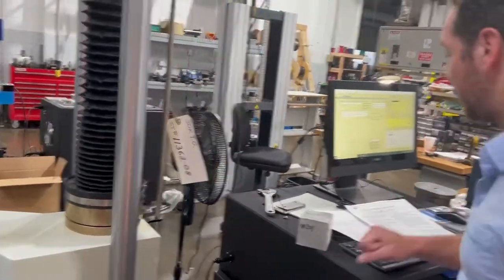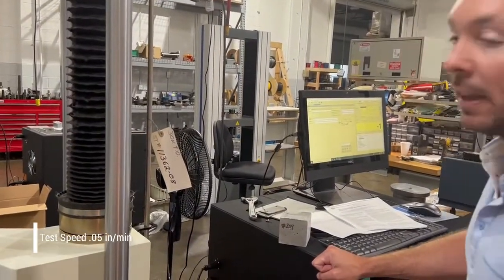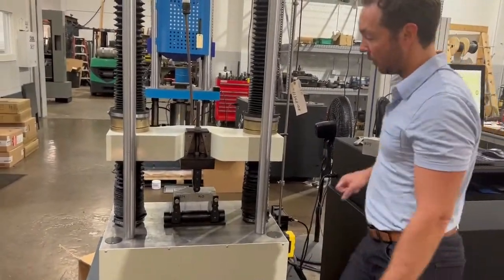Specimen is loaded. Now we're ready to run our test. For this test, we are running at a test speed of 0.05 inches a minute. So it's very slow, and we're taking this all the way till failure, which is usually a low drop-off, and we should see a crack in the specimen.